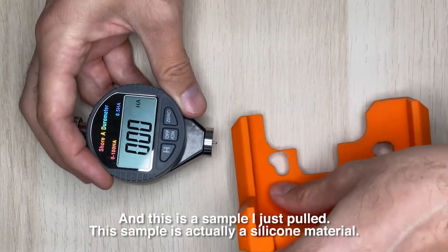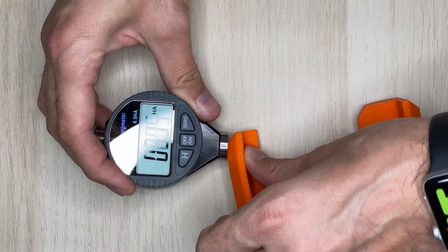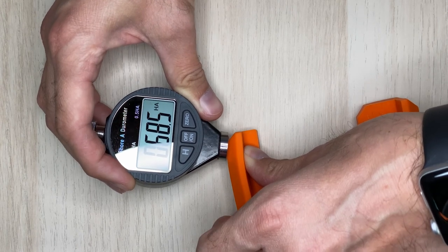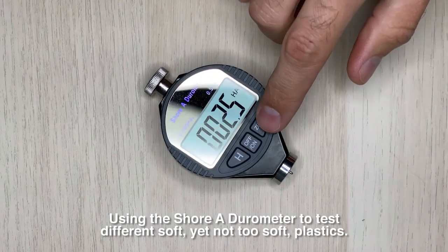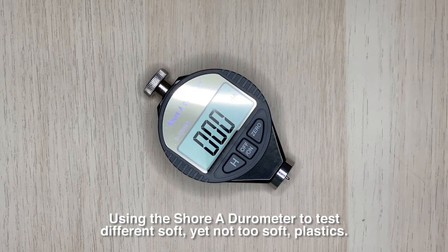And this is a sample — this sample is actually a silicone material, and it's also about 70. Interesting! So there you have it folks — using the Shore A durometer to test different soft yet not-too-soft plastics.